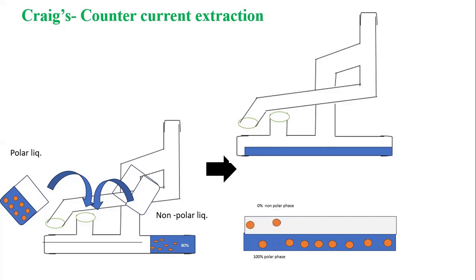In this way it transfers until both sides have 50-50% active chemical component. The transfer from higher to lower concentration is carried out until both phases have 50%, an equal proportion of the active chemical components. The same process occurs in this horizontal tube.